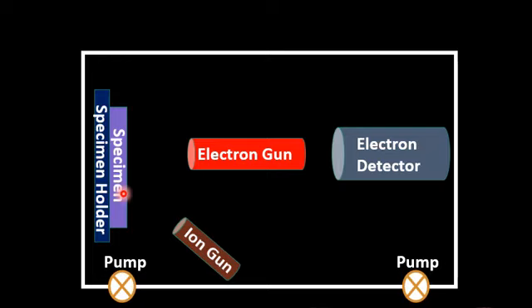In depth profiling usually sputtering is done. The ion beams are incident on the sample surface. The beam has higher energy and sputters the sample surface at different points, and then by doing Auger electron spectroscopy you can check the composition varying across the sample surface, and on the basis of that you can have an idea of the average variation of the composition across the specimen.